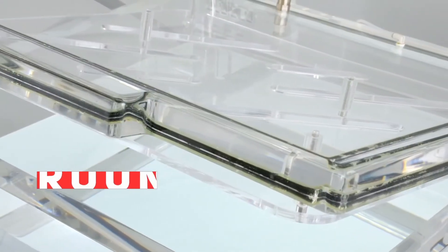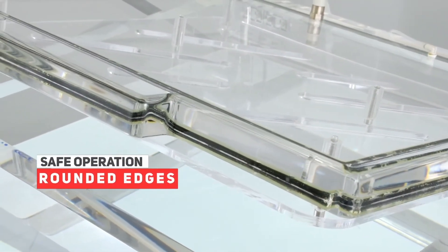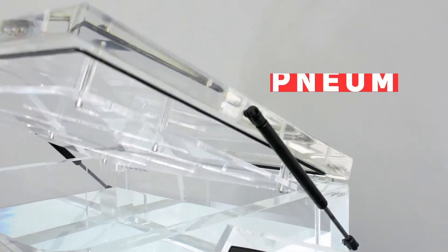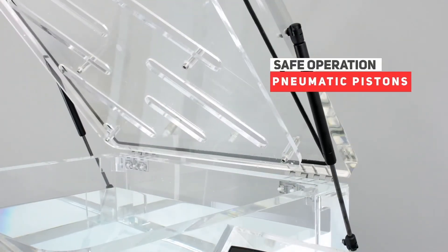All our vacuum chambers are designed with rounded edges, lifting cylinders for easy lid control, and accessories for immersion testing.